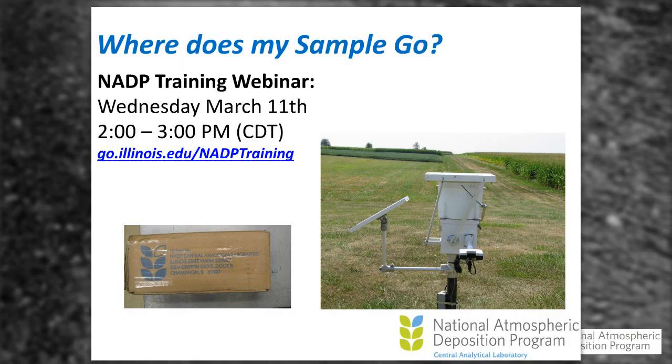Where does my sample go? Well, if you see the picture to the right and the box to the left, the sample comes off of the collector, goes into a little sample box, and away we go.